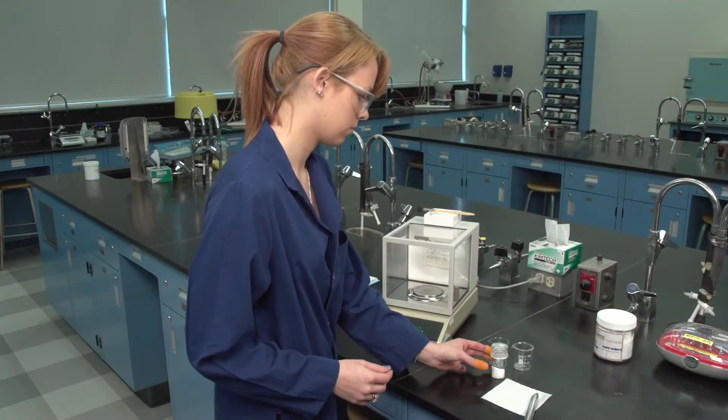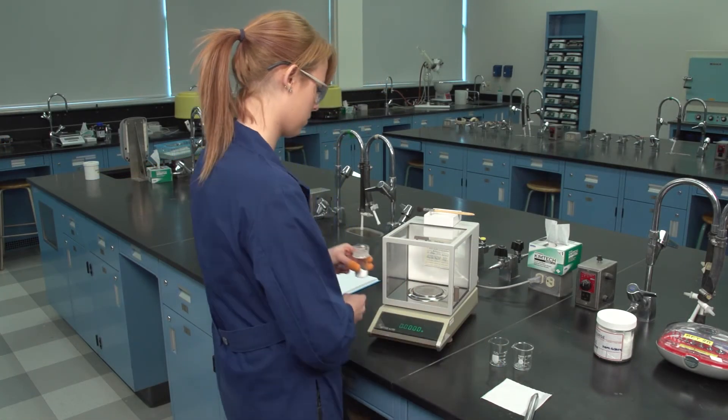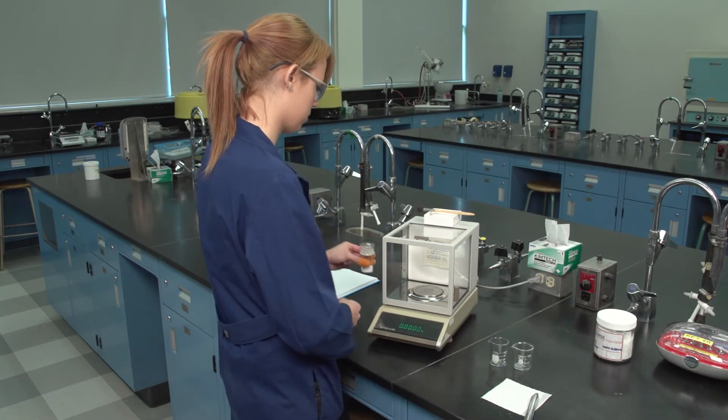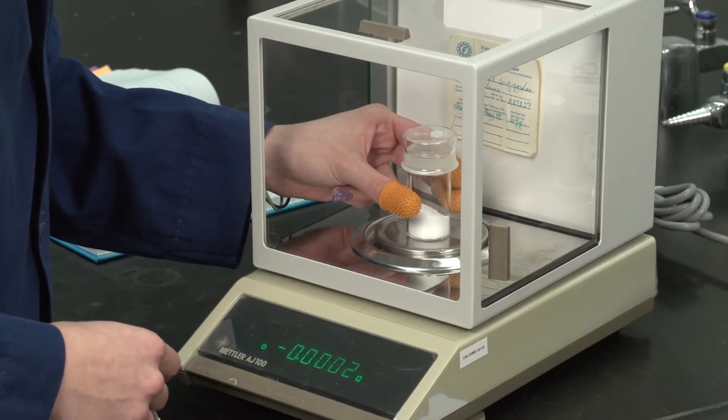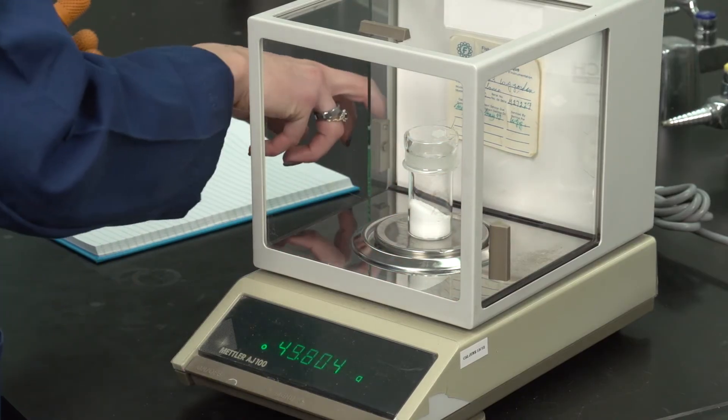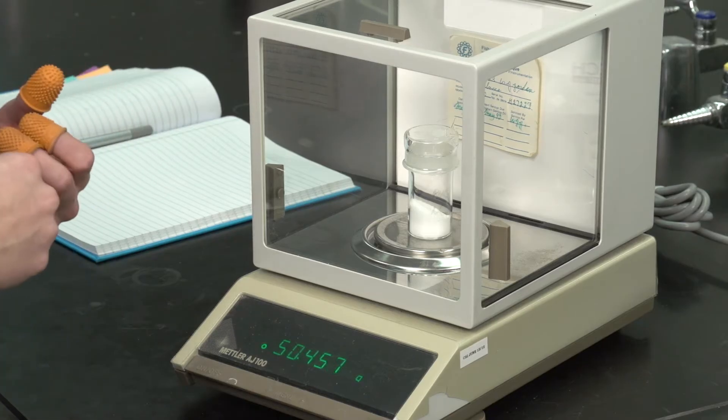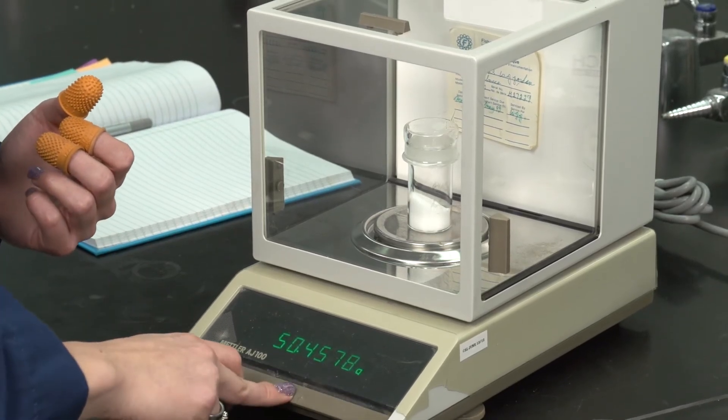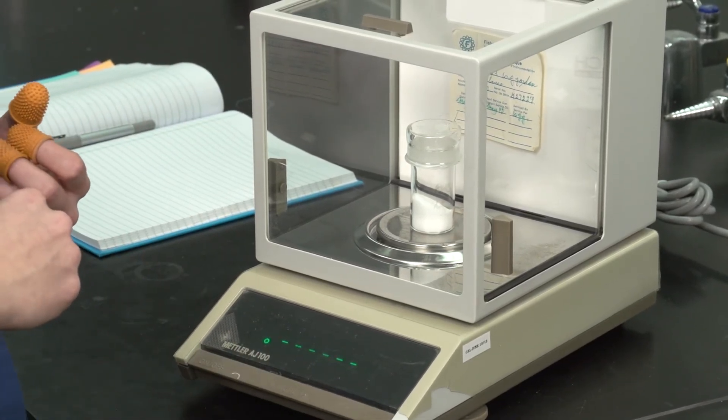Without touching the bottle with your fingers, place the weighing bottle on the analytical balance and press the tare to reset the balance to zero grams.